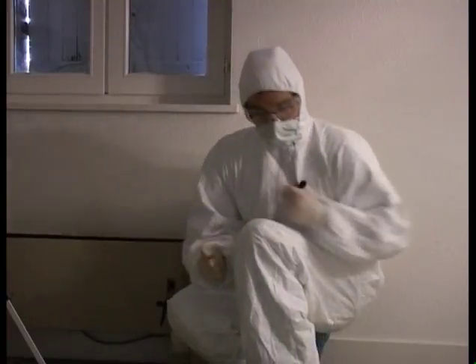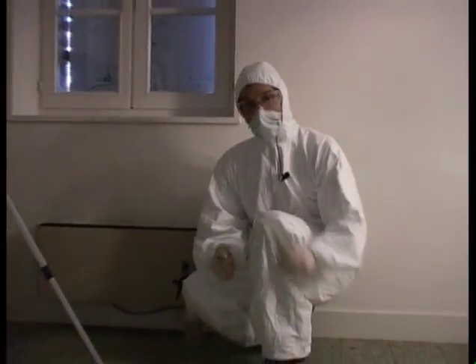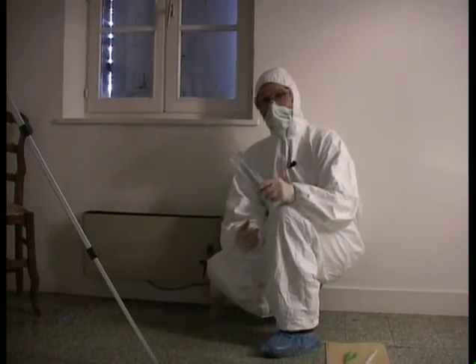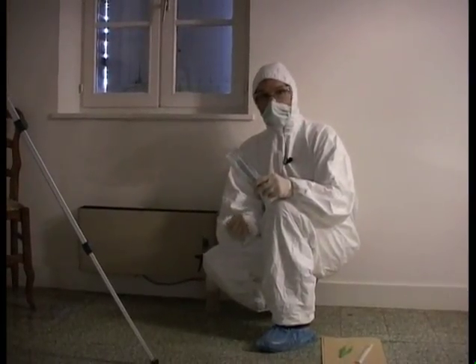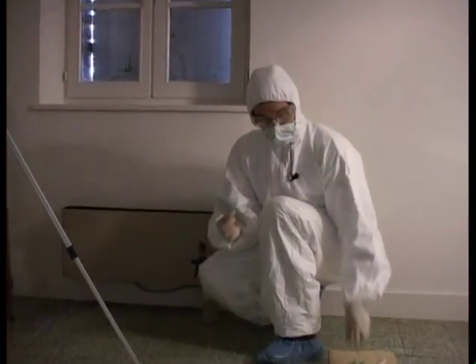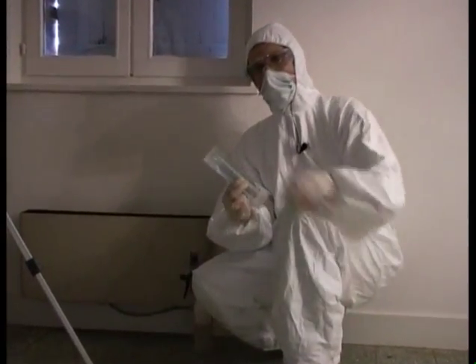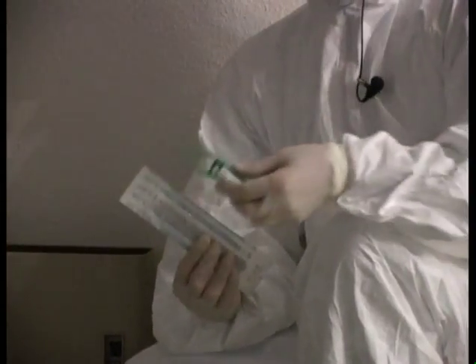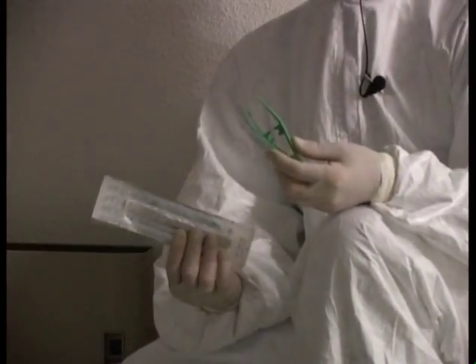There are two methods for this, but the recommended one is to remove the medium using a scalpel. Nothing is better than a scalpel for cutting the medium where the product reacted. We remove the entire medium that reacted by using a pair of tweezers. We use these instruments to avoid any genetic contamination.